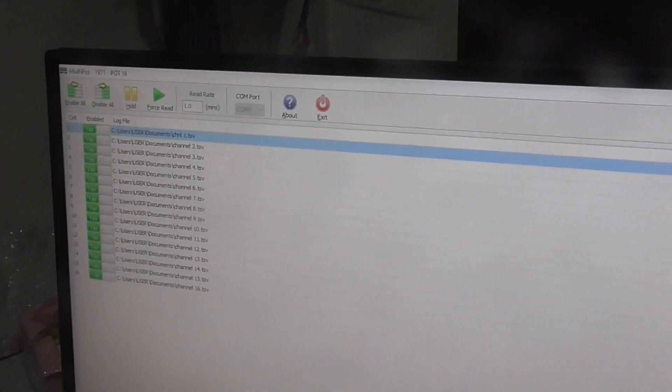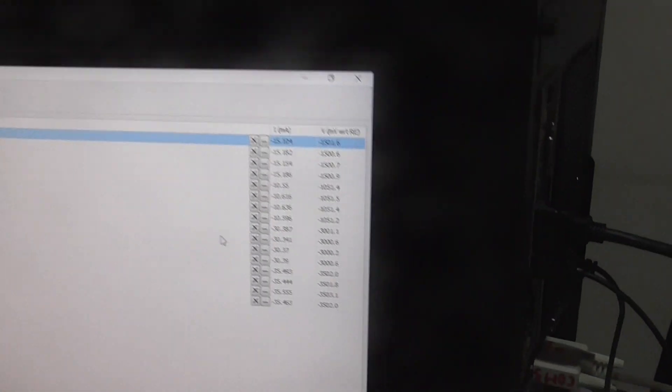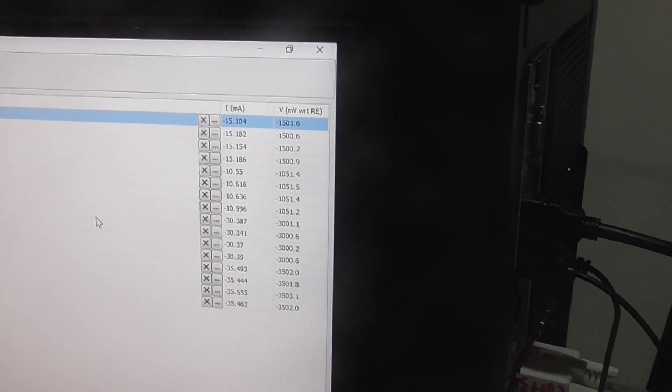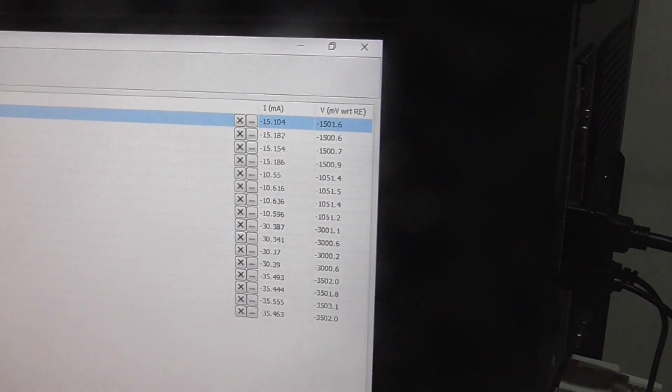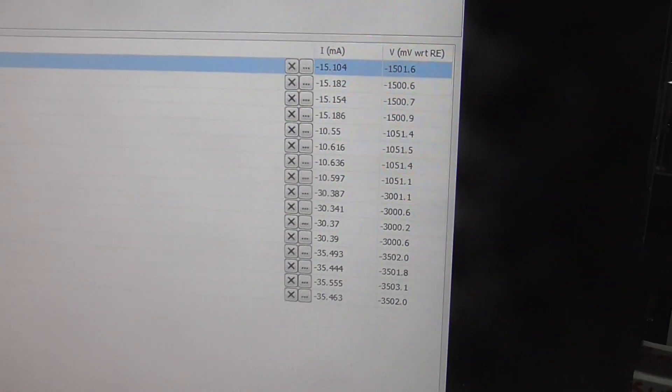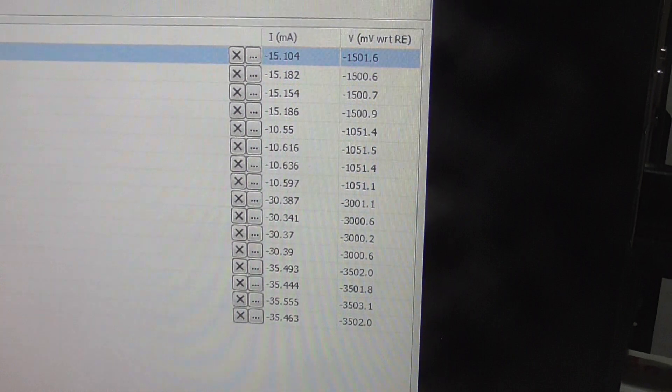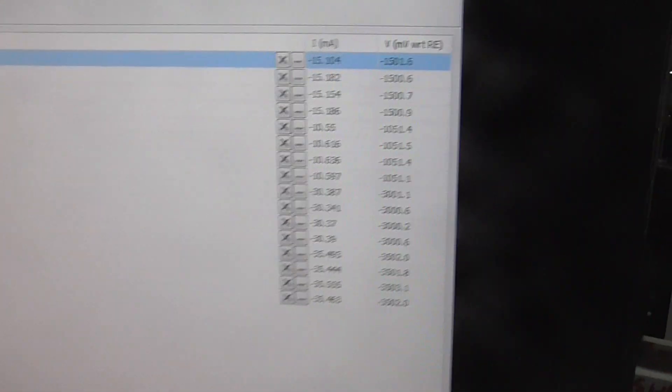Now it's on the software and it's running. If you can see here, it's reading channel 6 now. Every channel it tests as what we set as a reading rate.